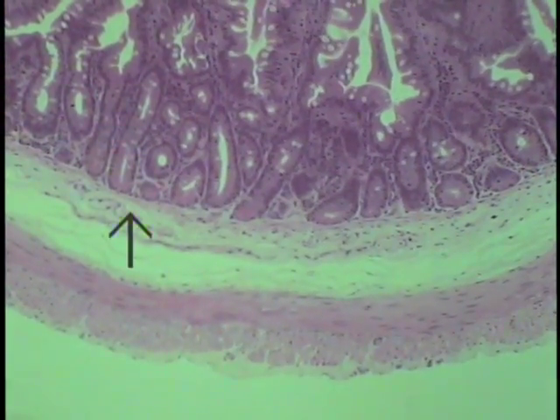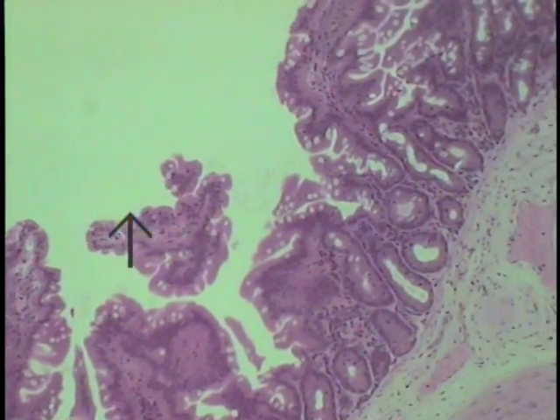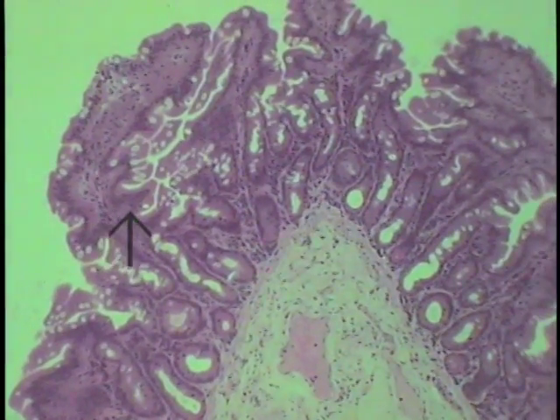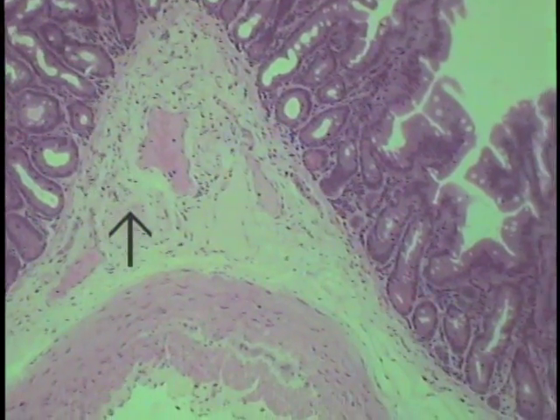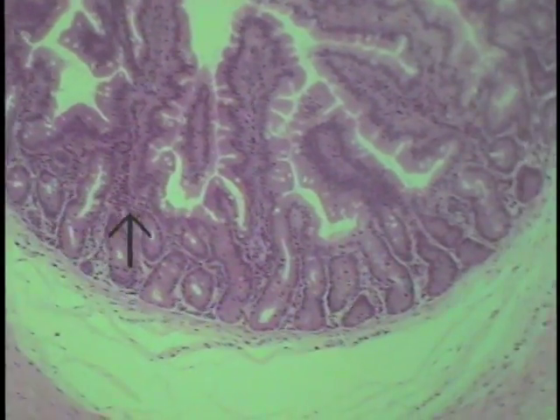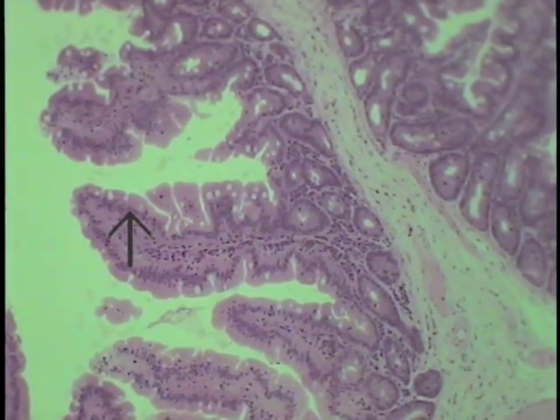So this piece of jejunum that was harvested for examination is probably taken fairly well proximally. The number of goblet cells within this mucous membrane shows you it's very much proximal, close to the duodenum perhaps. So we know it's a high segment or a proximal segment from the small intestine, but with the absence of Brunner's glands, which are found only in the duodenum, one must conclude that this is a section of jejunum, which is indeed the case.